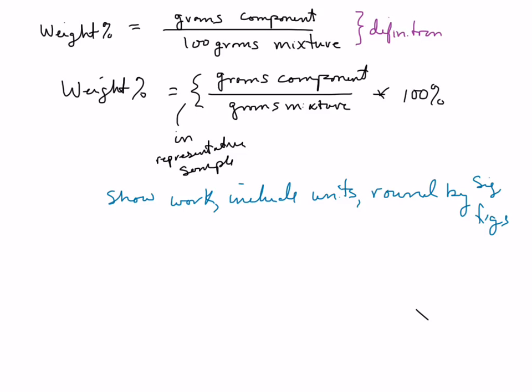So how do you get a mass of this one? And I think that mass kind of goes on the top of your data sheet for this part. These are the weighing boats for the components. There's an S for shell, a W for white, a Y for yolk already on there. I probably would grab one of these, put it in here, tear it out, and then carefully put my egg in there and hope it didn't roll off. That's pretty good. That's probably how you get the mass of the whole mixture.